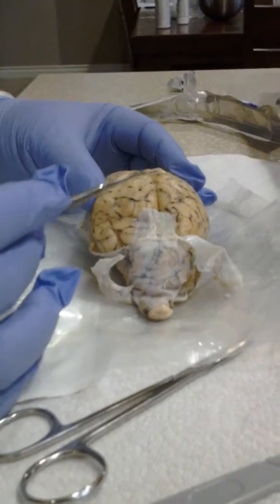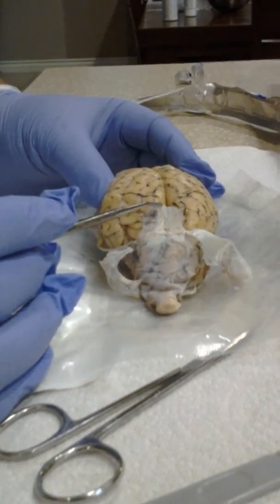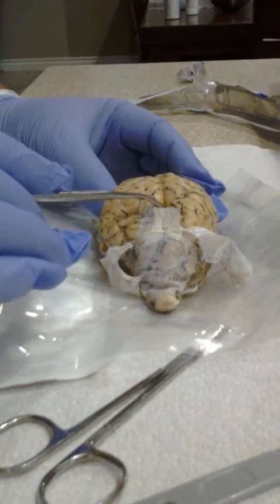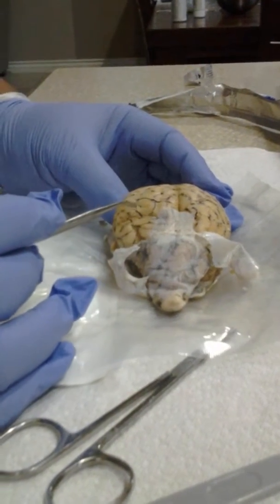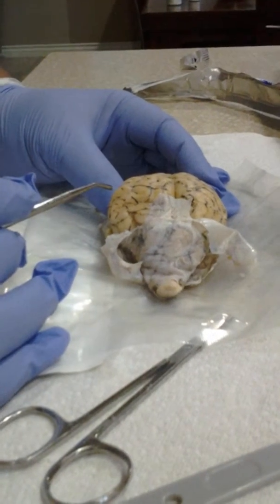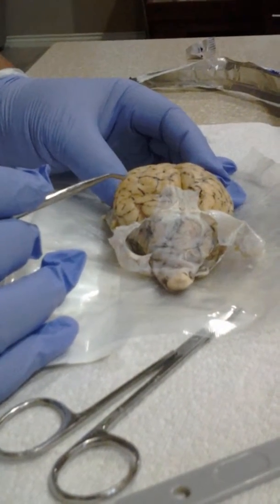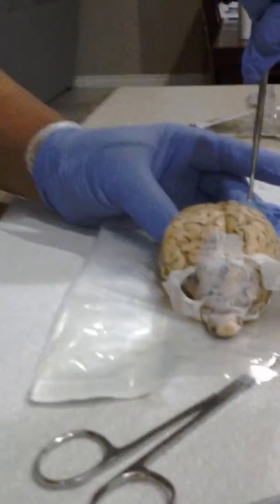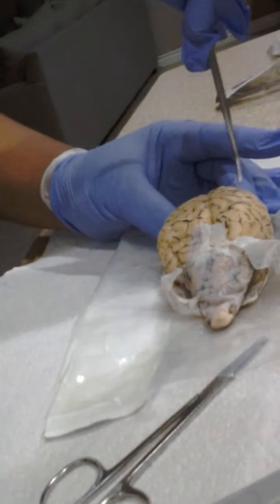Okay, here we have the superior longitudinal sulcus, this crease here in the middle. Then we have the gyrus over here, the sulcus right below it. And on this side here, we have the central sulcus, here in this area.